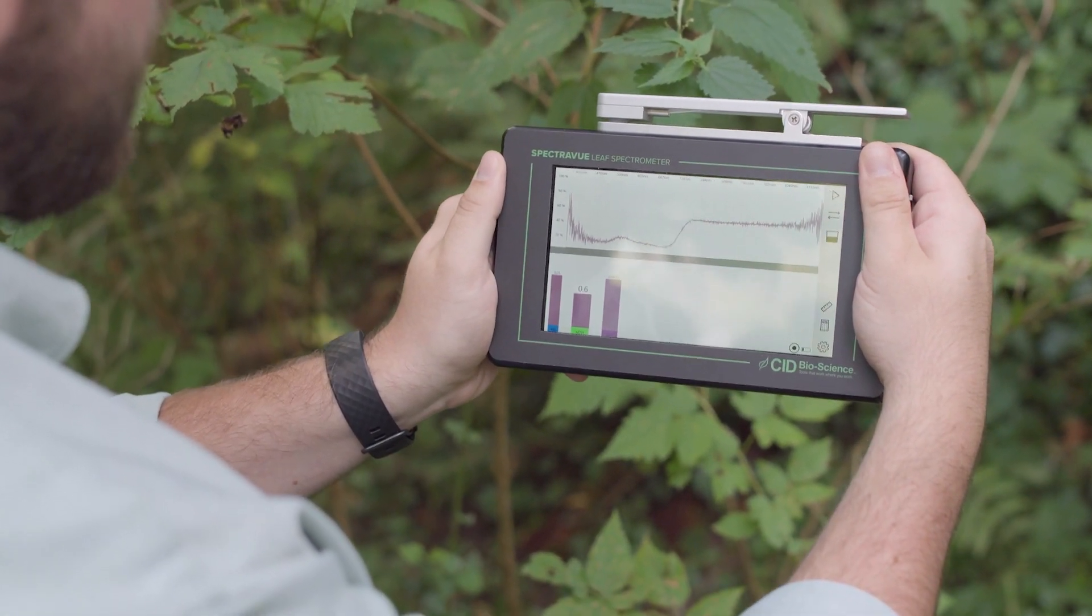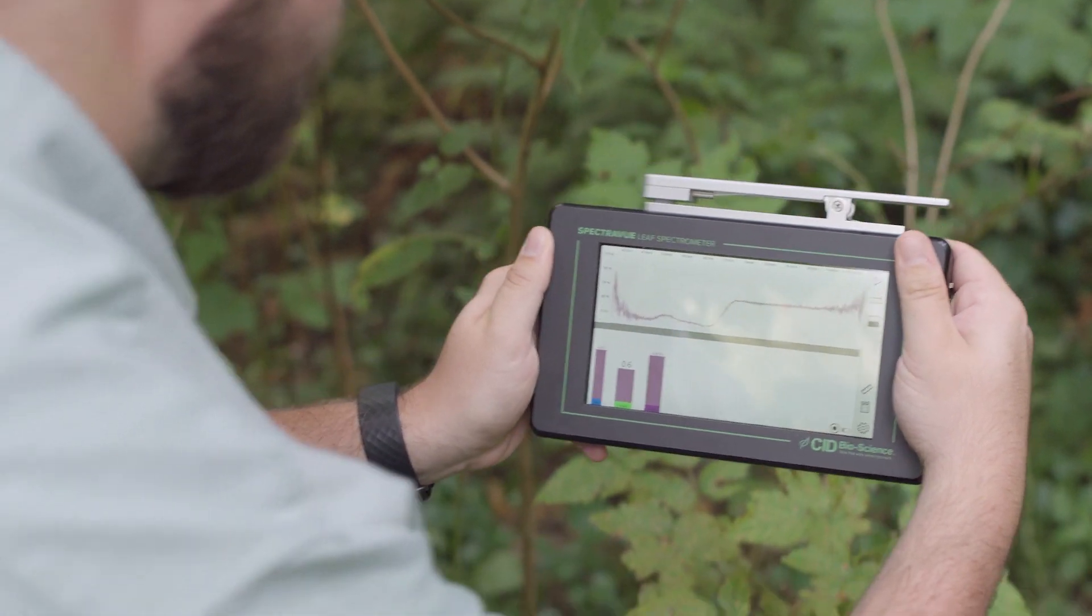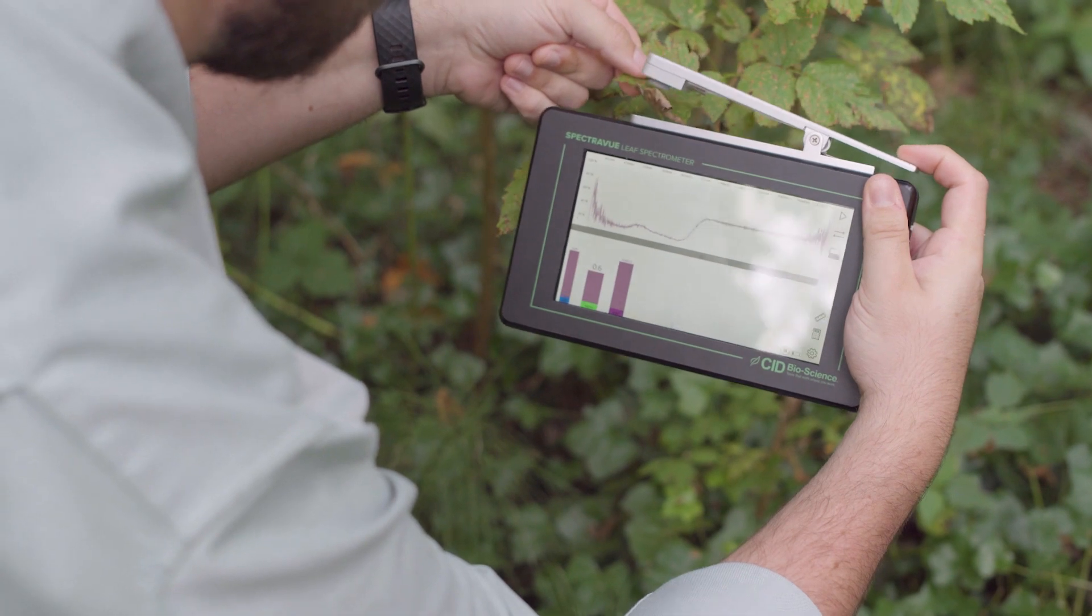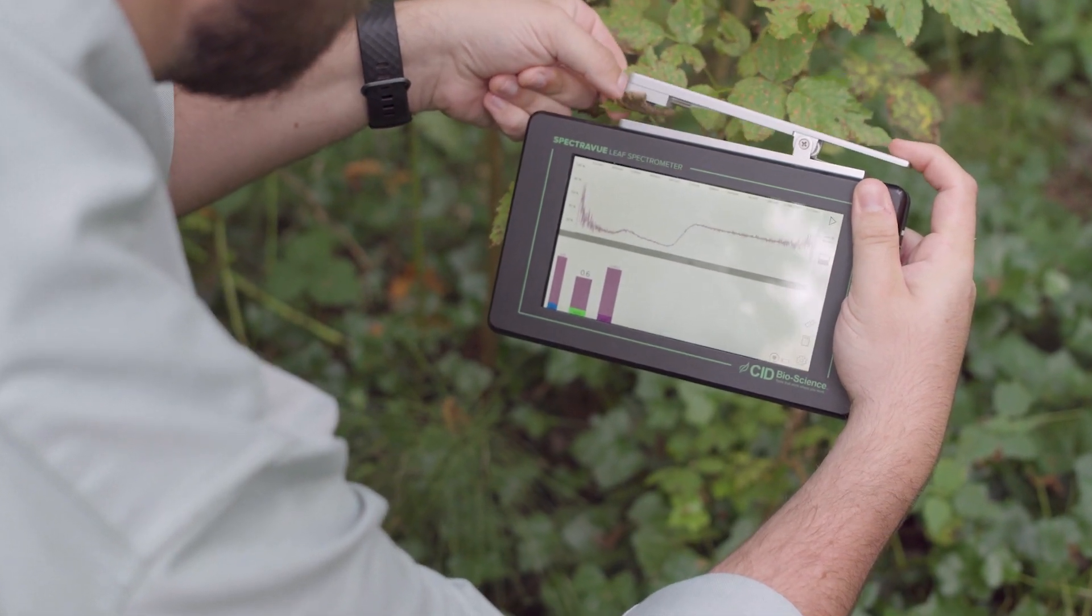So now we're going to go down and scan an unhealthy leaf. We're going to take it, do the same thing, and we're going to position it so that it's covering the entirety of the lens.